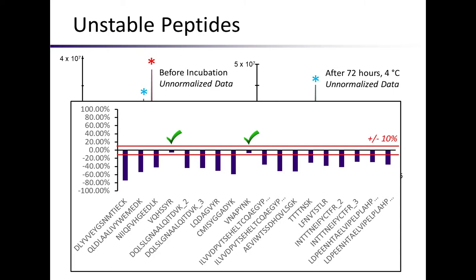Now, there's a very specific reason we use 72 hours. 72 hours is the amount of time that you need to put a sample in on a Friday and keep your autosampler running till Monday, so that your tech or grad student or postdoc doesn't have to come in on Sunday and maybe try to skip paying for parking and maybe have to talk their way out of a parking ticket on campus. Not that that ever happened, but we're just going to prevent that from happening.